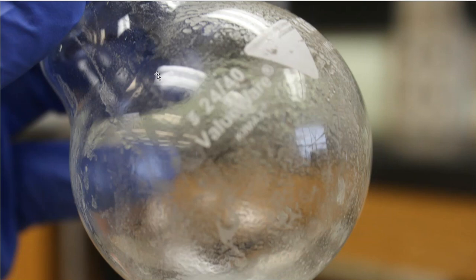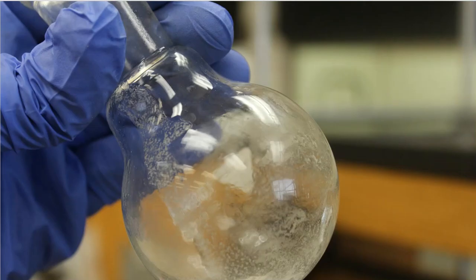When I do dump it over, this is what's left over in my boiling flask. I'm okay with this. This doesn't look like liquid to me. It doesn't look like the hexanol product. This just looks like potassium carbonate that did not get dissolved in my boiling flask, and it's that solid, sludgy stuff that's still left behind. So I did not have to worry about completely transferring all of that over.